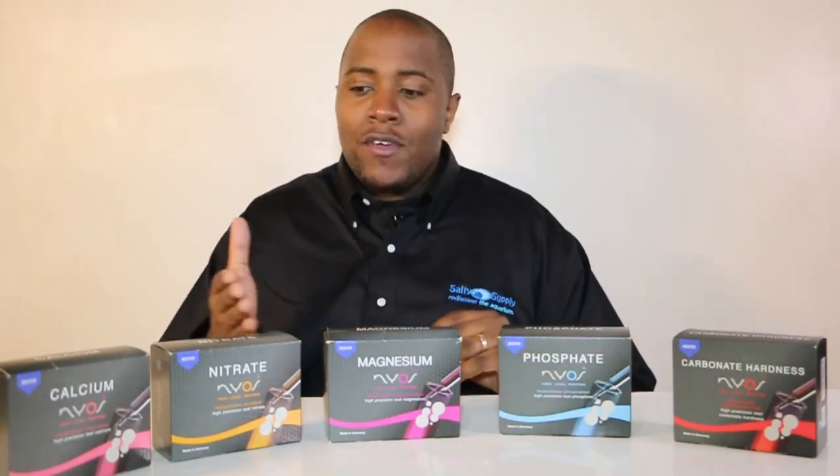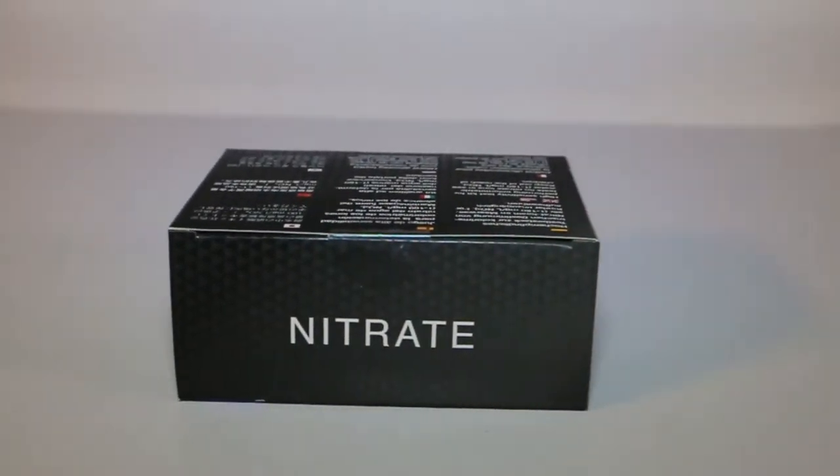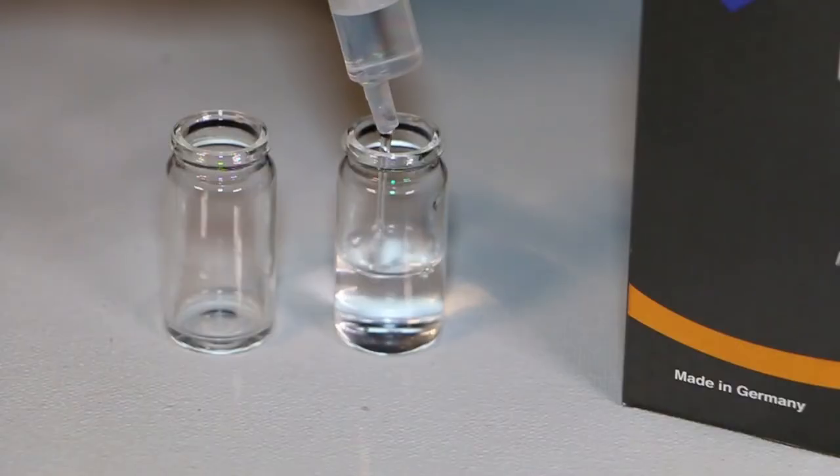I decided to do this video because I've never used Nyos test kits before and they're supposed to be really simple to use. I decided to go with the nitrate test kit to demonstrate whether it's easy or hard to use, and then give you my opinion on it.